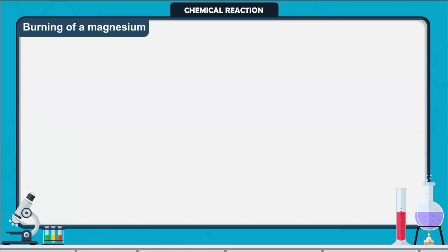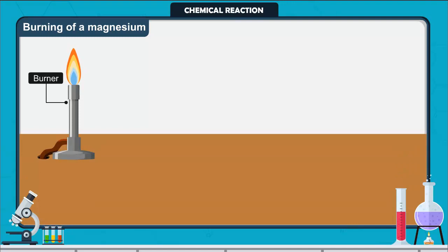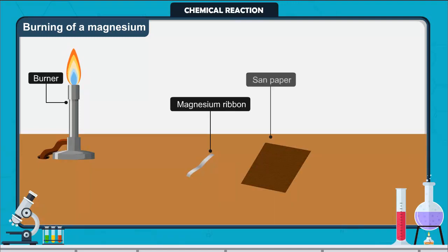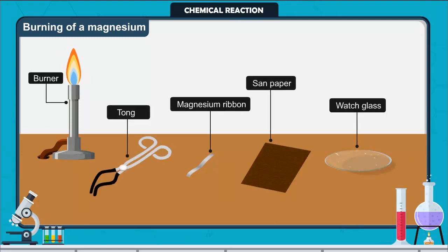Burning of a magnesium ribbon in air. For this experiment we need a burner, small part of magnesium ribbon, sand paper, a tong, and a watch glass.